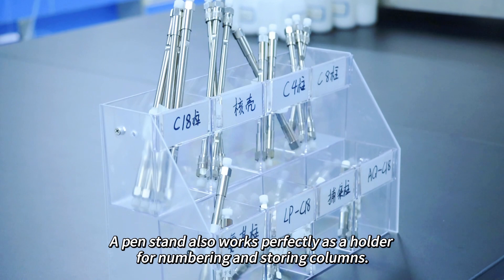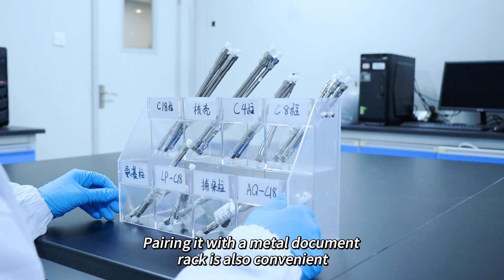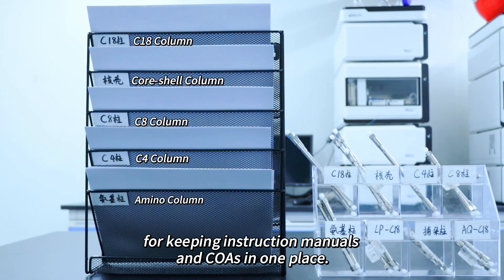A pen stand also works perfectly as a holder for numbering and storing columns. Pairing it with a metal document rack is also convenient for keeping instruction manuals and COAs in one place.